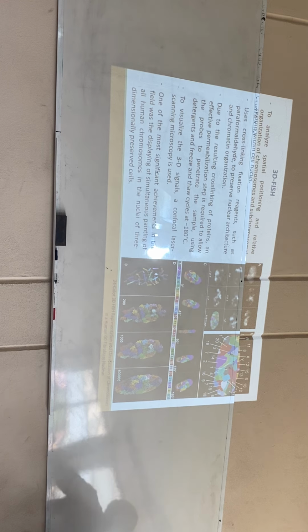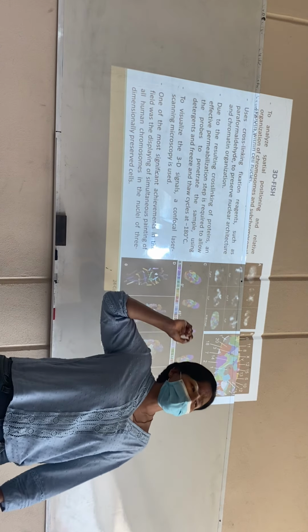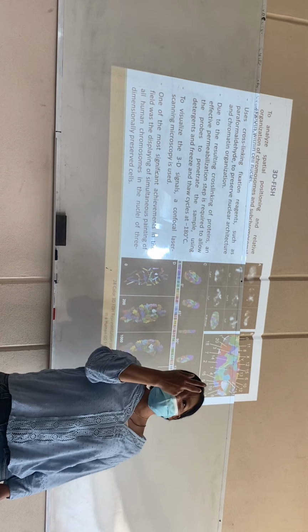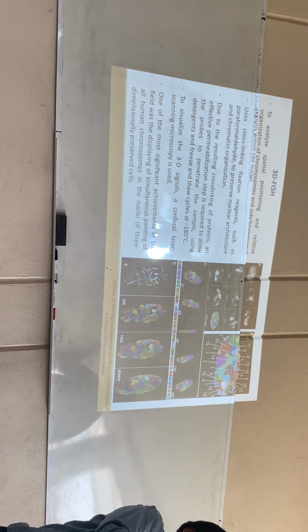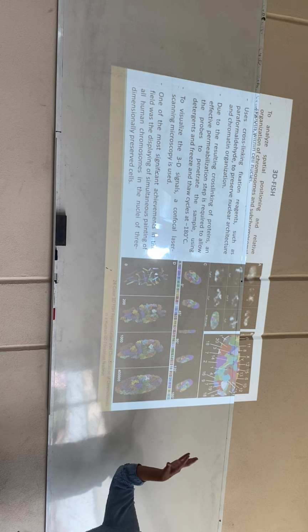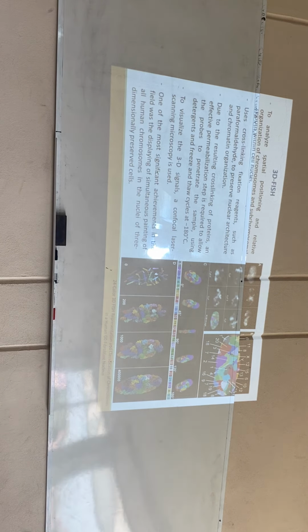Do you have any questions with this? The only difference is the microscope that is utilized to capture the images. The name of the microscope is confocal microscope. And then the second difference is the software. The software that is utilized to record the image and to manipulate the image is different from the other examples that we have seen. Okay.